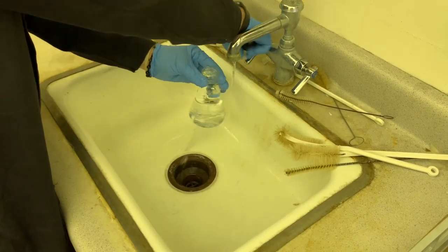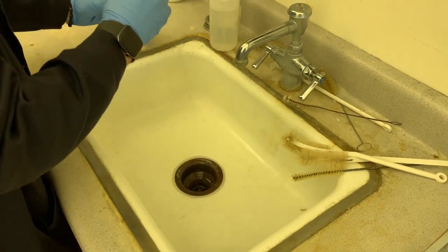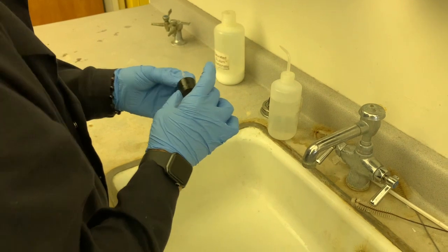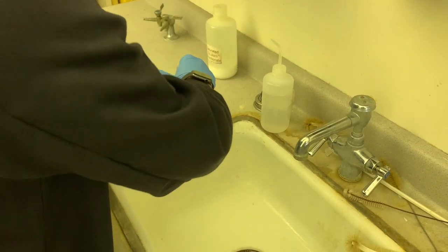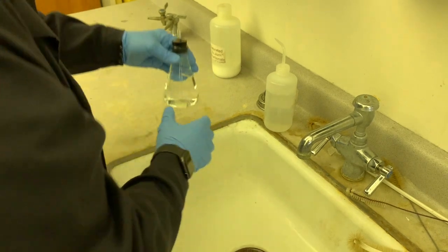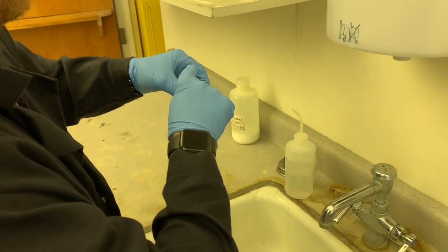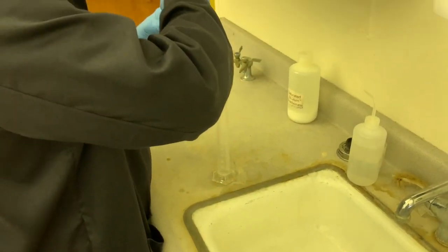Try to fill it up as much as possible. It's important to also make sure that you compensate for the volume that's inside of this tube. It's a good milliliter, maybe 2. And so you're gonna push everything through. It might shoot a little bit. And this is the full flask. Maybe a tiny little bit lost there, that's fine. Remove the stopper carefully.